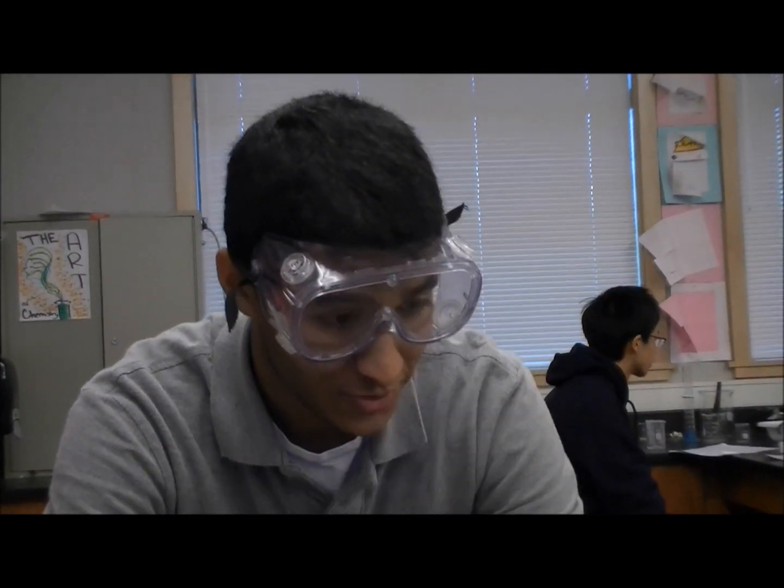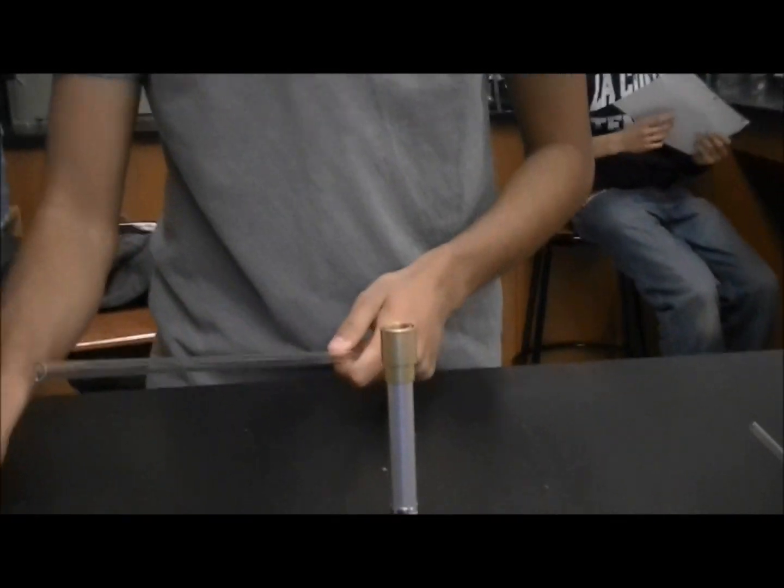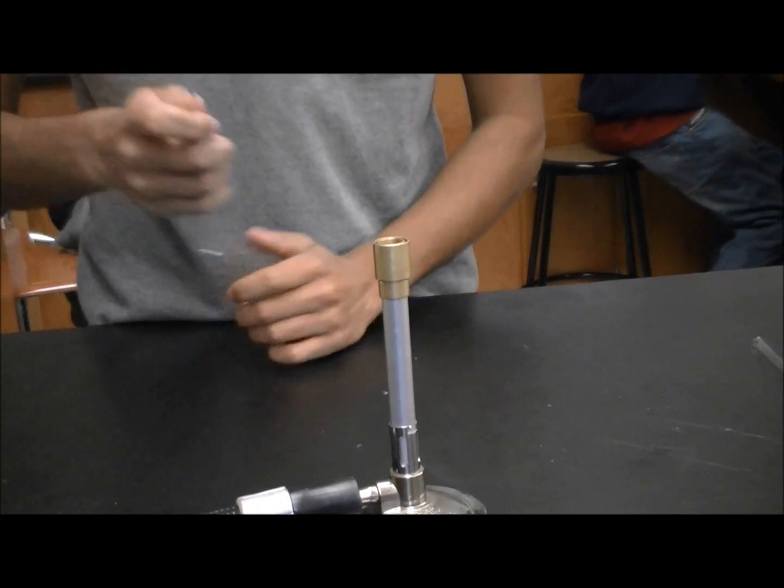Alright, right now we're going to be making a salt bridge. A salt bridge is essentially a way for ions to flow between the anode and the cathode. To do this we're going to take some glass tube like this and a Bunsen burner, and we're going to basically bend it over the flame.